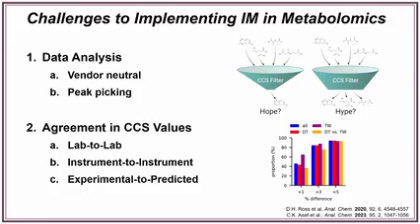And while there have been some pretty good vendor-specific options that have come out, put out by the vendors themselves, so proprietary software, it's only been in maybe the past 5 years that there are some really good vendor-neutral free software tools that you can use to do data analysis on ion mobility mass spectrometry data. The other thing to consider is how the ion mobility dimension is being used in peak picking, and a lot of this is still mostly driven by there being an LC dimension. So that's something to keep in mind.